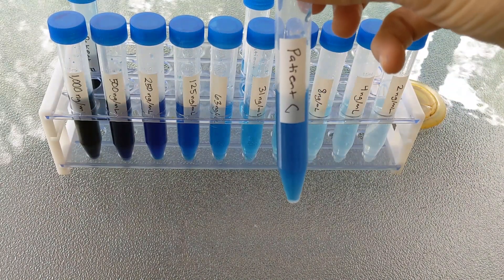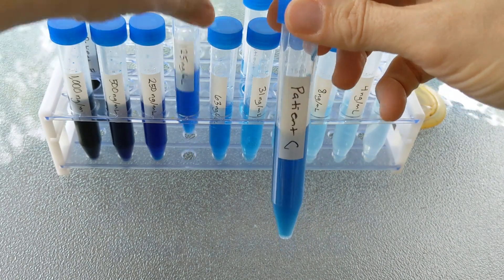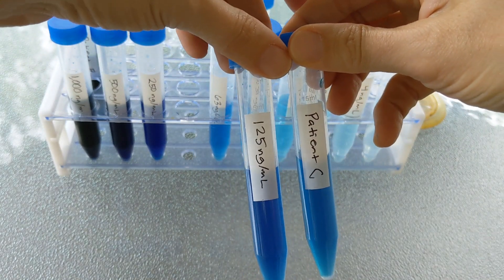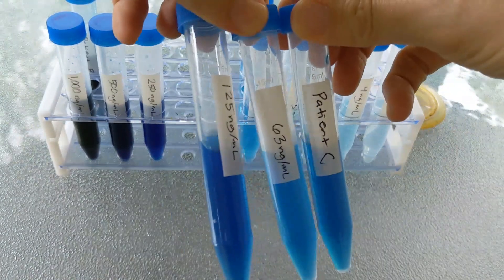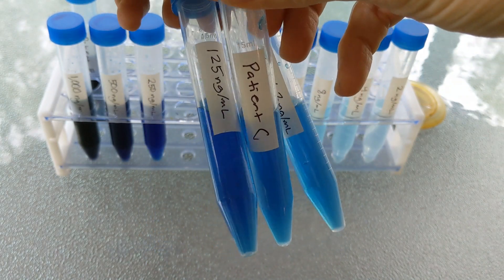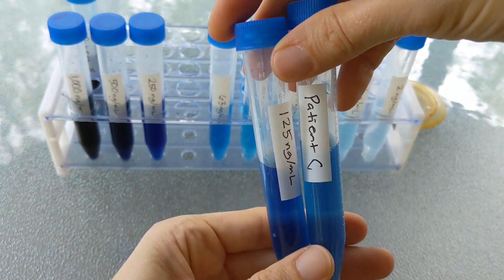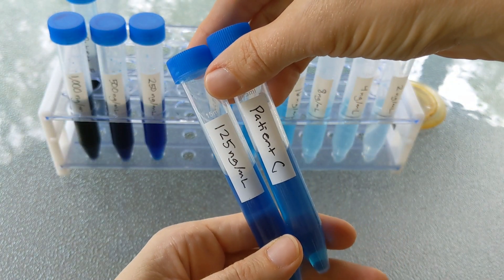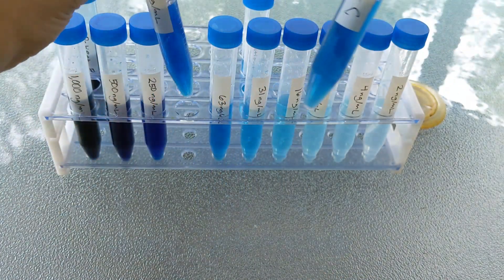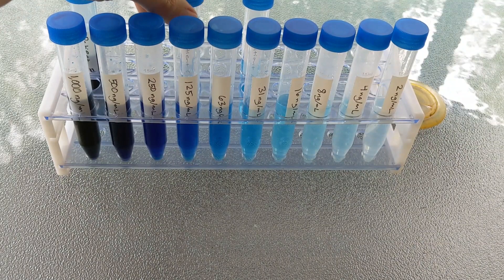Patient C, paler than the last one, but maybe darker than the first one. Let's see if that's a match. I think that's a match for 125. Those look pretty well matched to me. So patient C has an antigen concentration of 125 nanograms per milliliter.